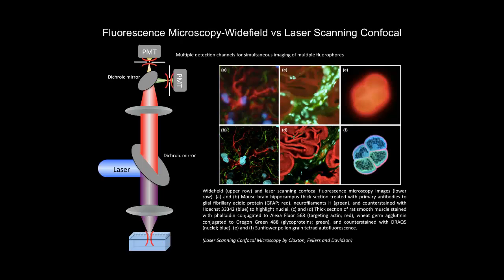So if you have more than two fluorophores that you want to image, how would the setup look? You would use, let's say you want to capture 4, so you use 2 dichroic mirrors? It depends on the number of the fluorophores. If you have 2 fluorophores, you use 1 dichroic mirror. If you have 3 fluorophores, you use 1 more dichroic mirror.